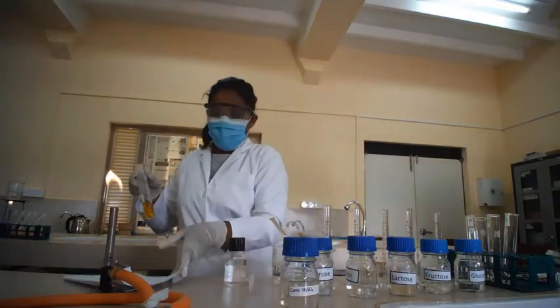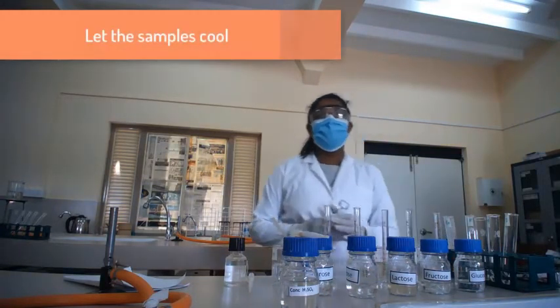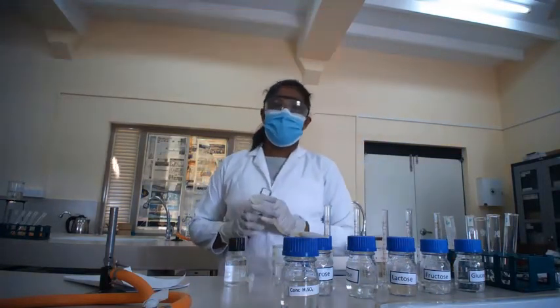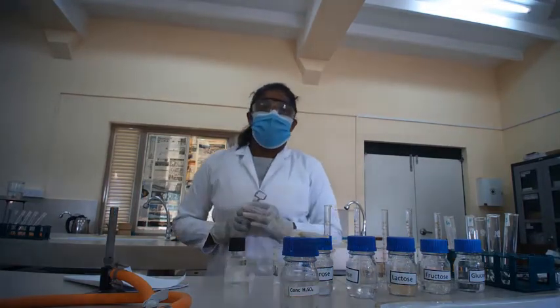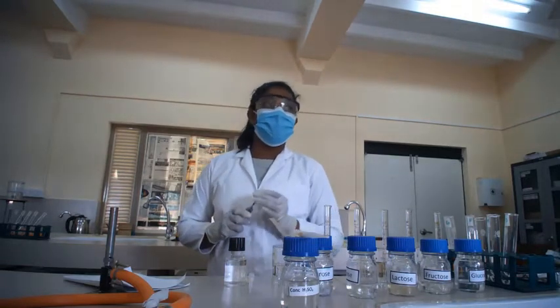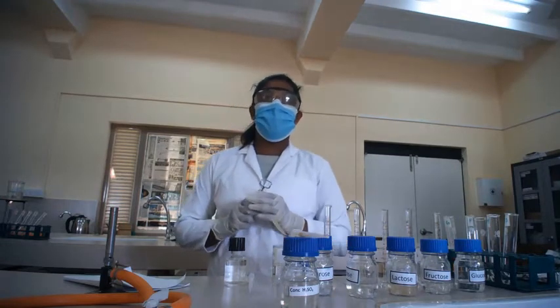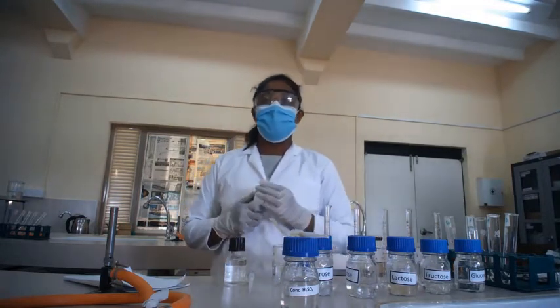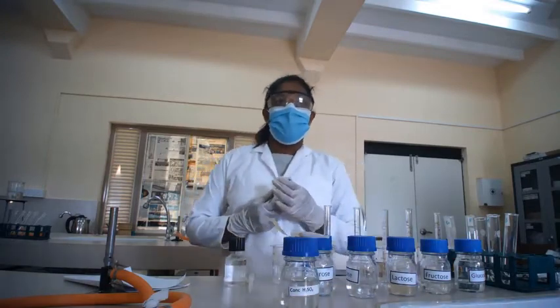Now we are going to let it cool for a few minutes before adding sulfuric acid. Why are we going to let it cool? Because this solution is already boiled, and if we add sulfuric acid at that moment, it will cause some explosion. Therefore, we have to let it cool down for some time.